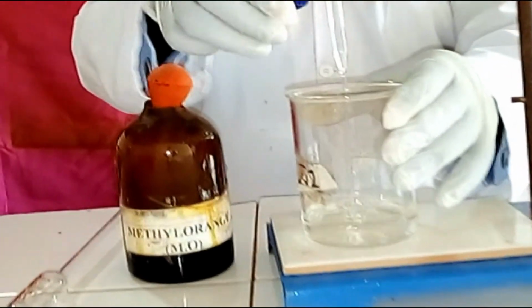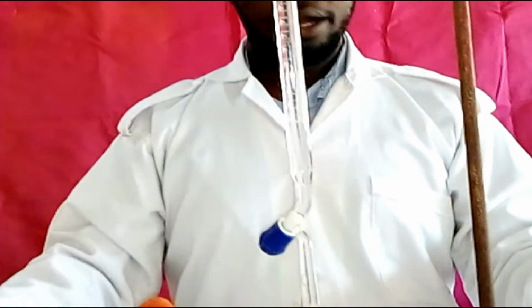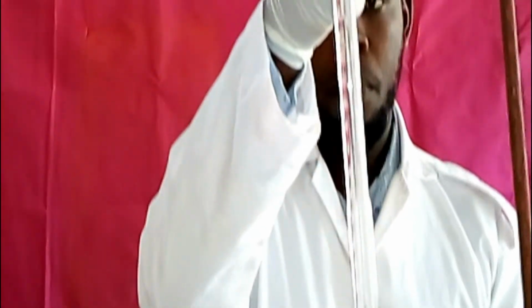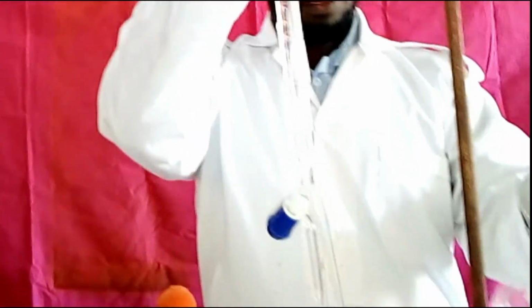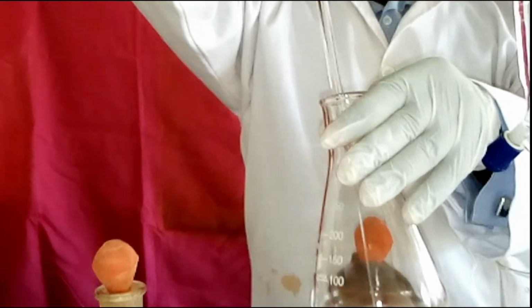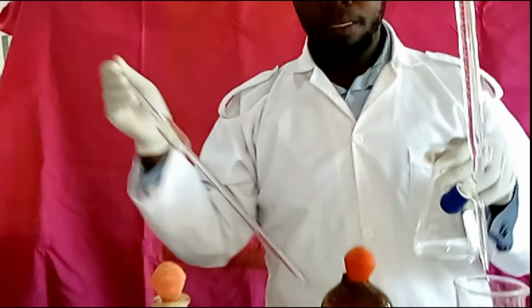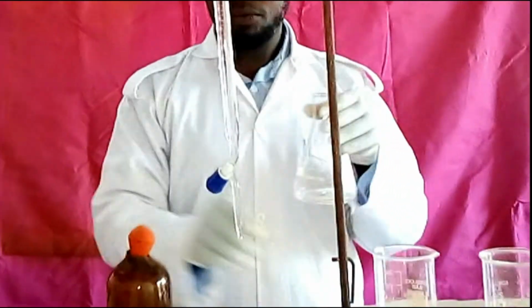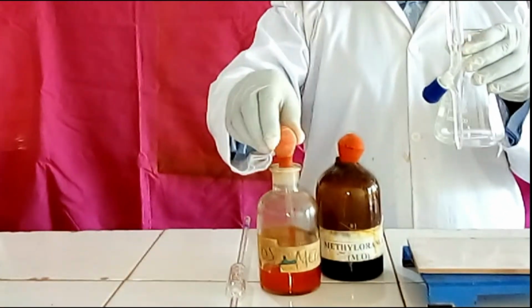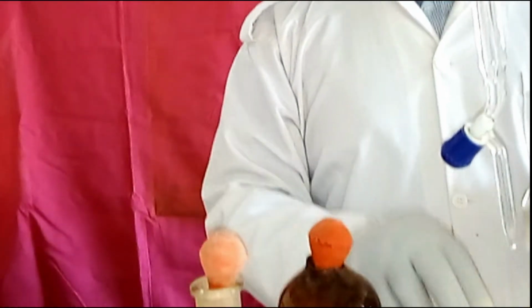Now we are going to fill our burette. The filling of the burette is ready. The second procedure: we are supposed to pipette our solution. Then after that, we put the base solution into a conical flask. Then we put 2 drops of indicator: 1 drop, 2, or you can add up to 3. That is the color change. Then let me start our titration.